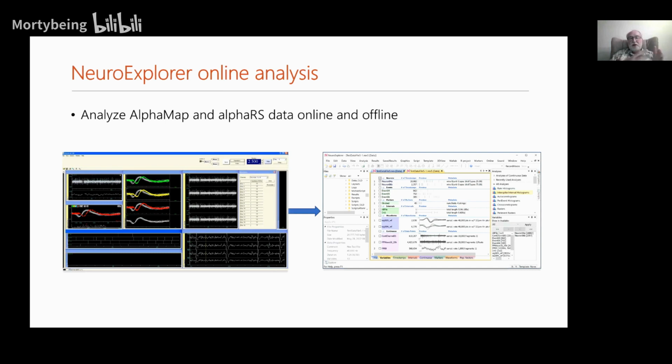Basically, you record for 5 minutes and run your analysis, and then every 5 minutes, or however many minutes you specify, it resets to no data and the data accumulates again. You also specify how often you want to analyze your data, for example every 10 seconds, so every 10 seconds you'll have an update of your analysis on your screen.